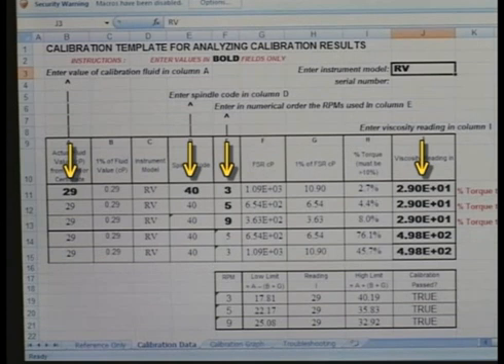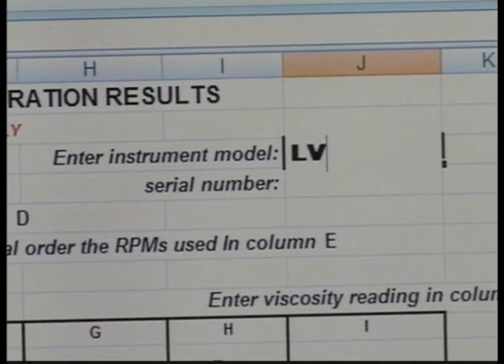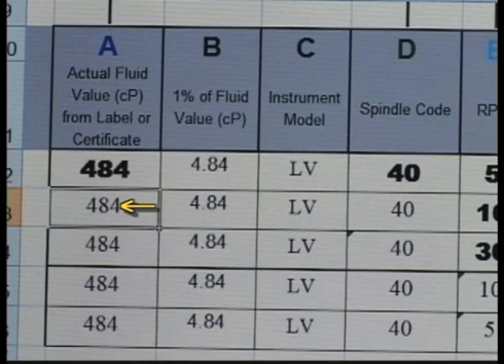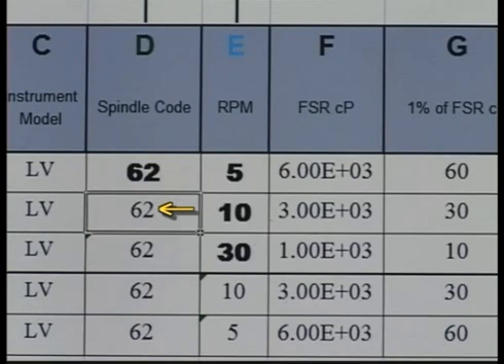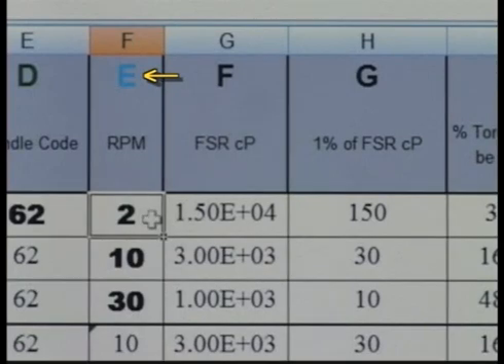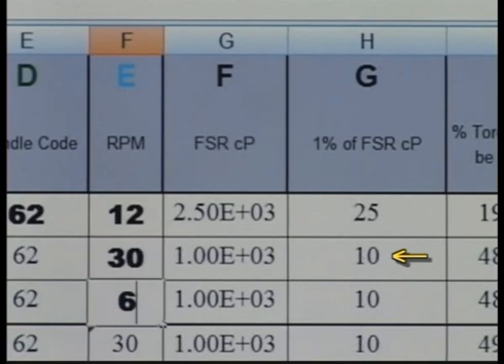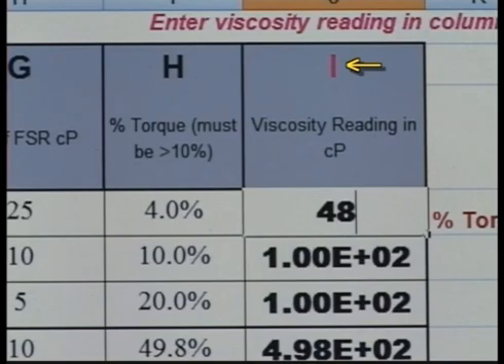Enter data in the bold fields. First, enter the spring torque of your instrument — in this case, this will be an LV. Enter the actual value of the fluid in column A. The remaining fields in this column will automatically update as this value will not change. You can see the 1% fluid value column will update based on this entry. This is the accuracy of the fluid. Enter the spindle code in column D; again, the fields in this column will automatically update. Enter the three speeds you will be running in column E and observe the 1% full-scale range in column G is updated. This is the accuracy of the viscometer at this range. Now, run the three speeds you have selected. Record and enter the data in column I.